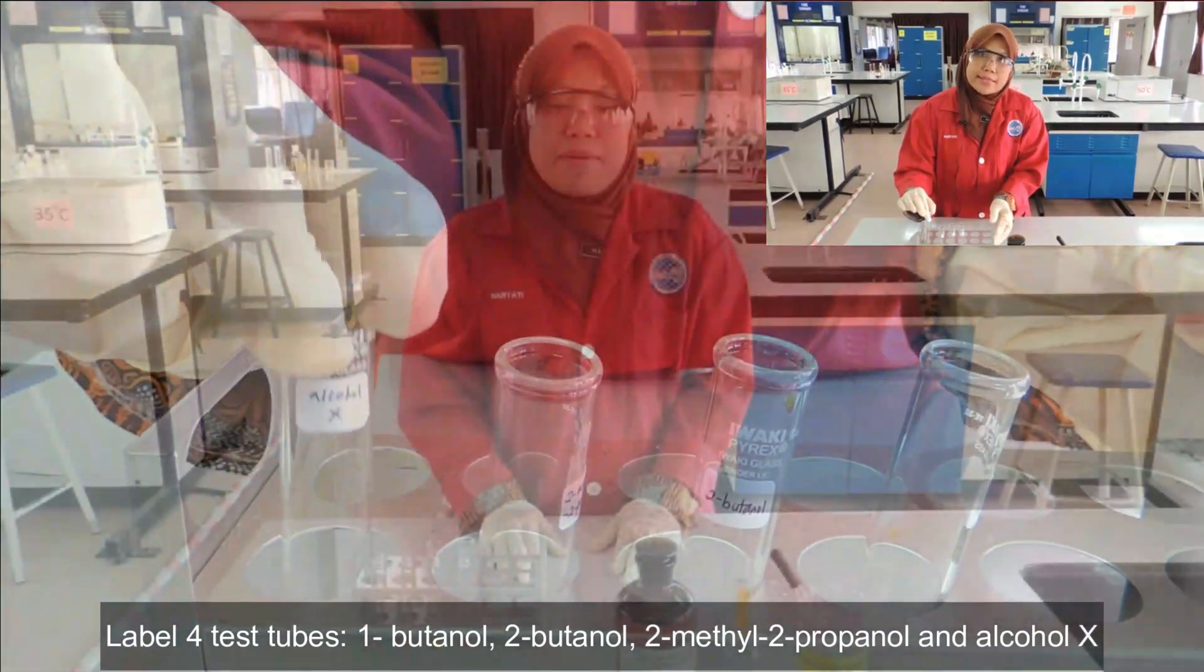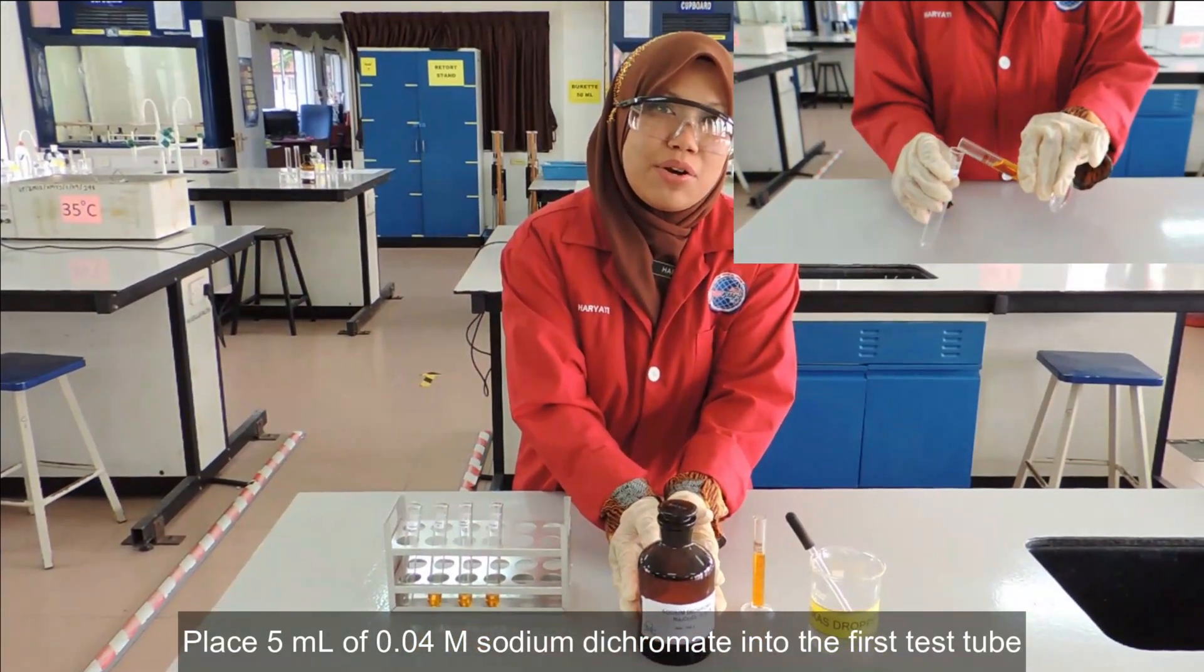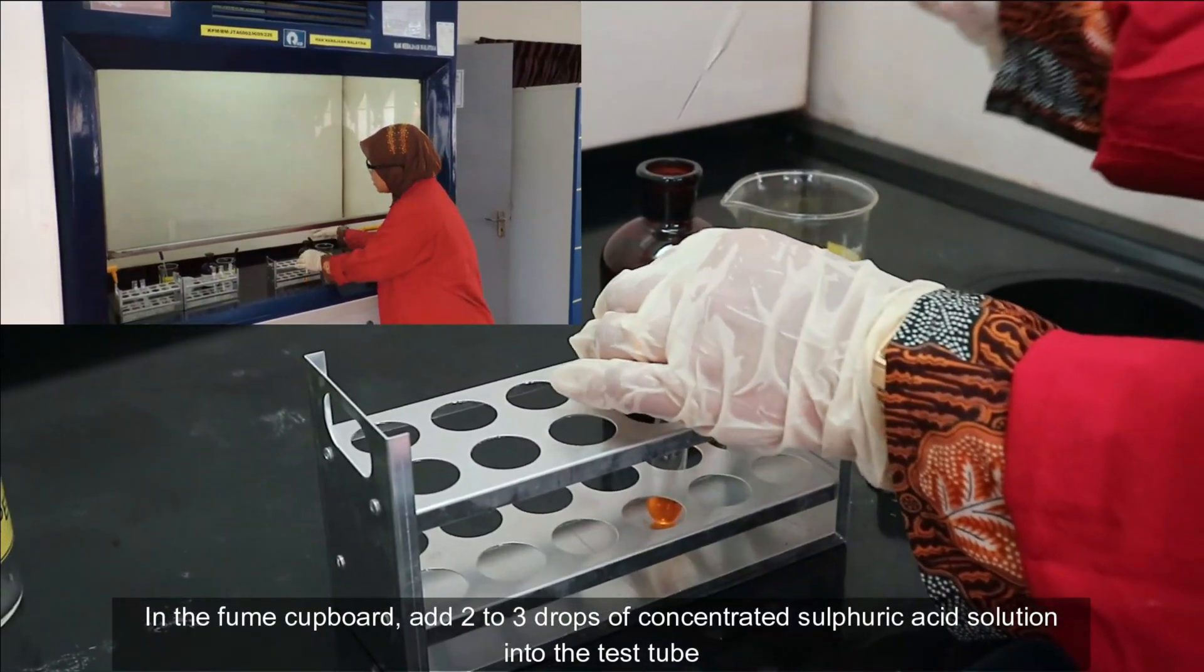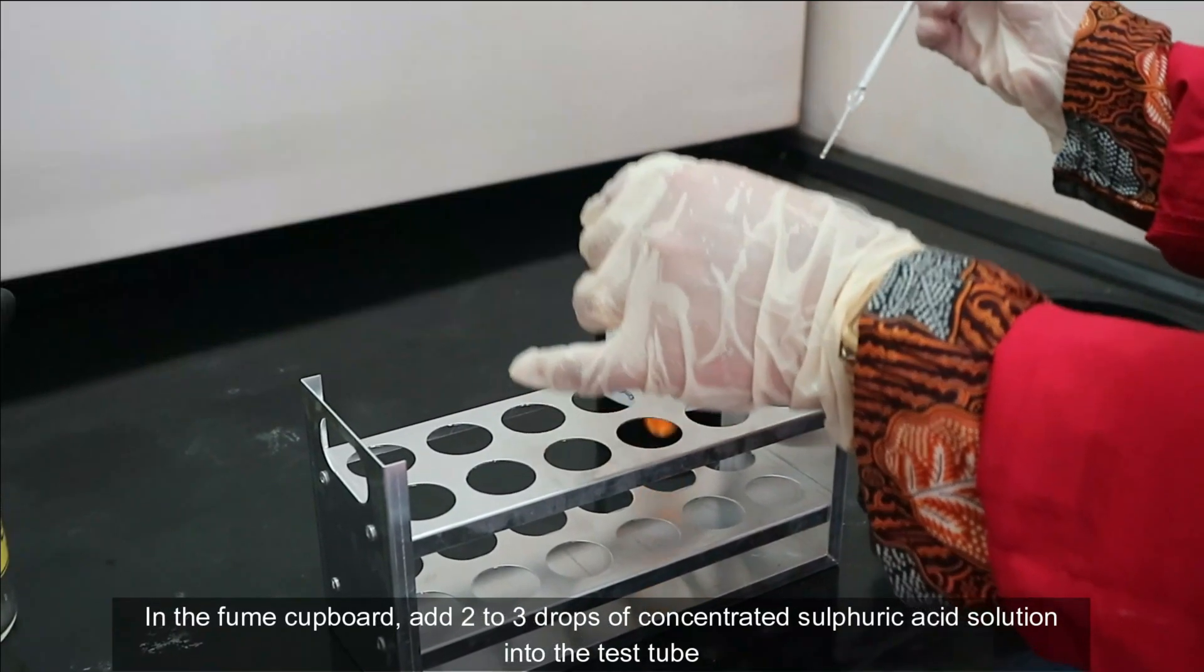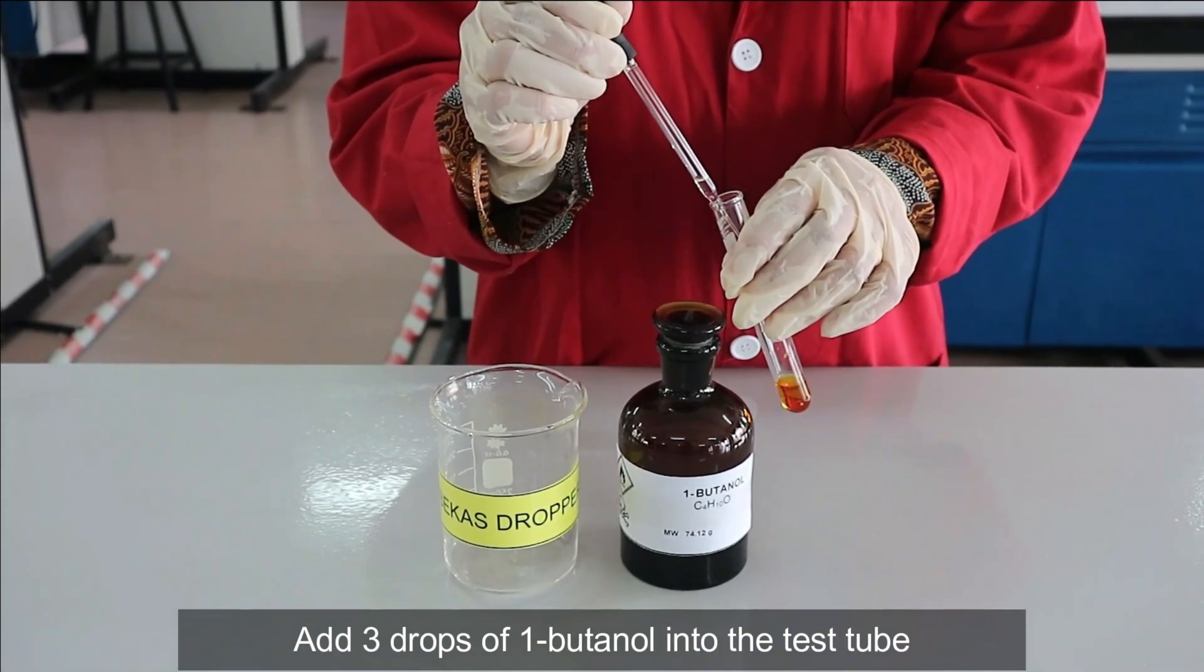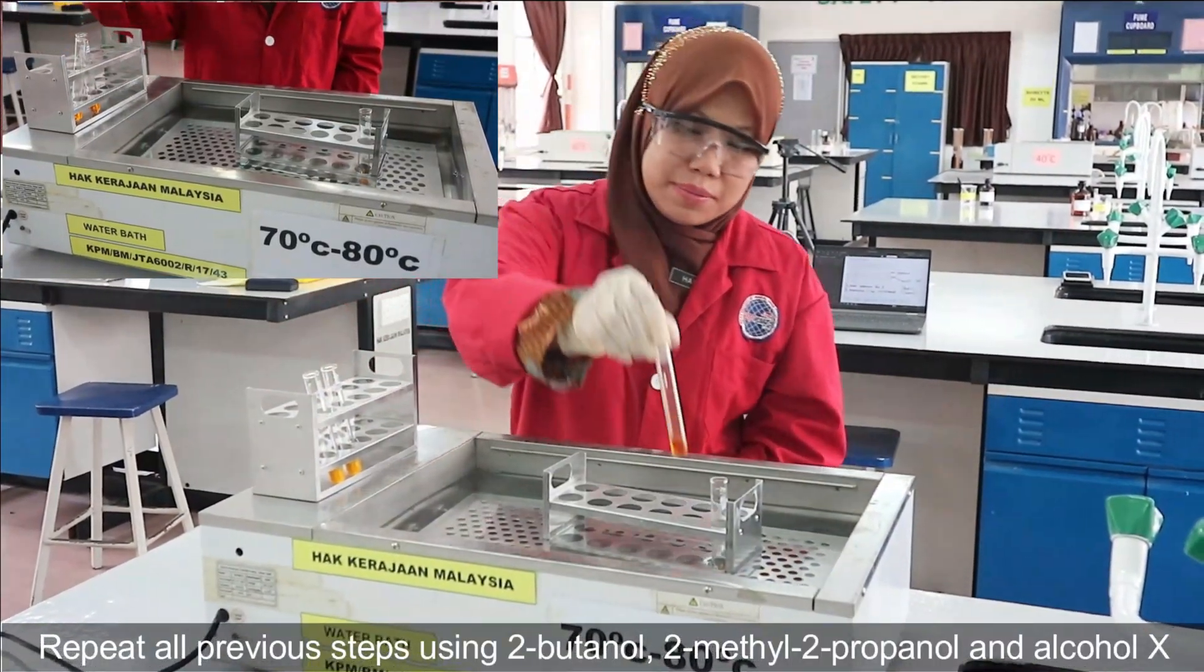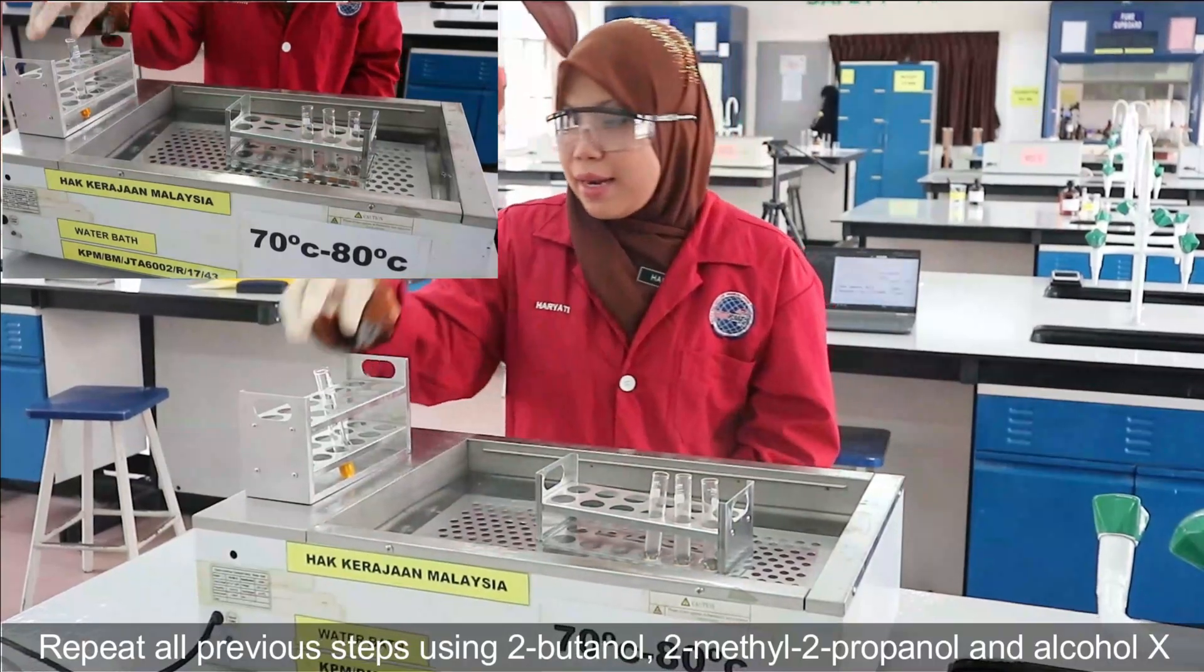First, place 5 ml of 0.04 molar sodium dichromate into the first test tube. In the fume cupboard, add 2 to 3 drops of concentrated sulphuric acid solution into the test tube. Add 3 drops of 1-butanol into the test tube. Heat the test tube in the water bath. Repeat all previous steps using 2-butanol, 2-methyl-2-propanol, and alcohol X.